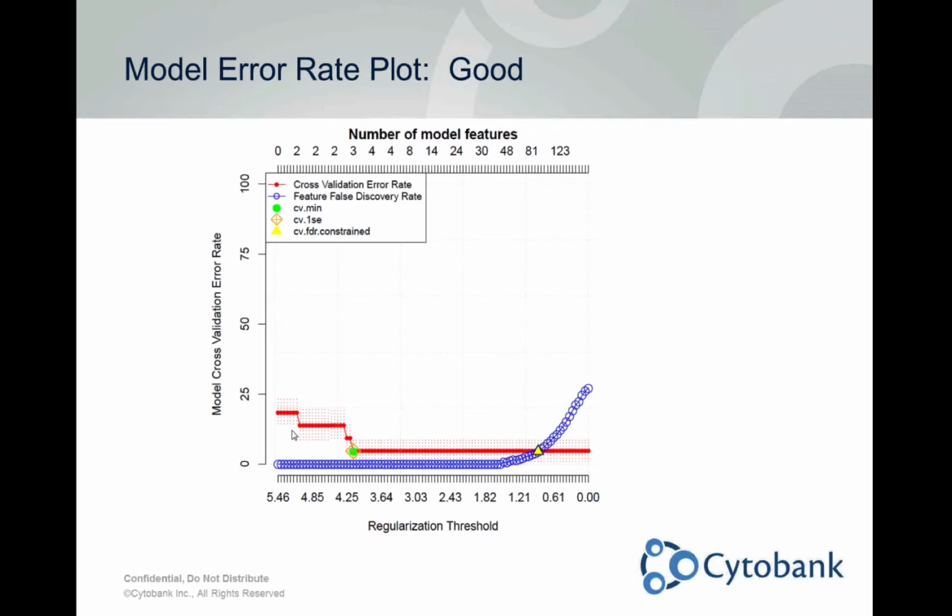It looks at a series of model features. These are either the abundance of a cluster or the median value of a cluster. So either one of those could be a feature depending on what you started with. And so it says, all right, just looking at these 2 features, do I have a good model? And it fails about 20% of the time.